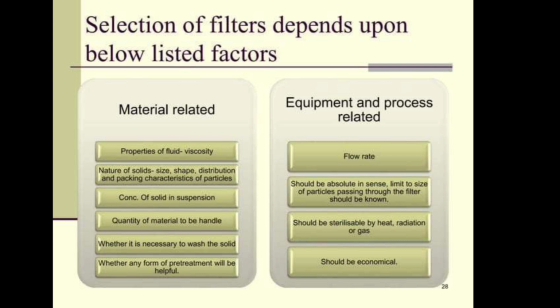Equipment and process related: flow rate should be absolute in sense. Limit to size of the particle passing through the filter should be known. Should be sterilizable by heat, radiations or gas. Should be economical.